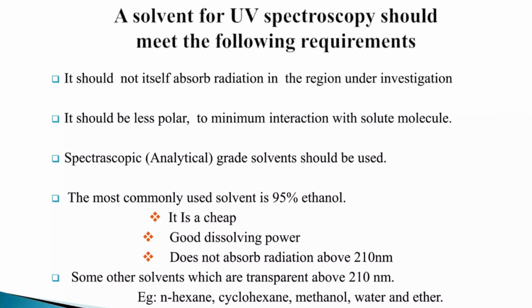Solvent selection criteria: minimal absorption in the measurement range and low interaction with the analyte. Common solvents include ethanol, methanol, hexane, and water, which exhibit low UV cutoff wavelengths.